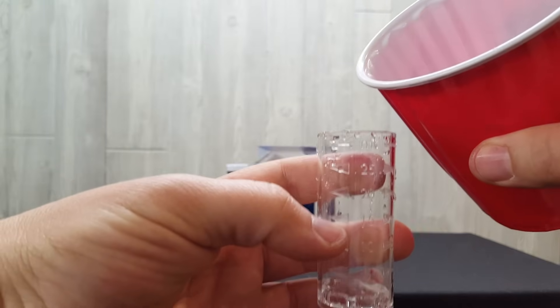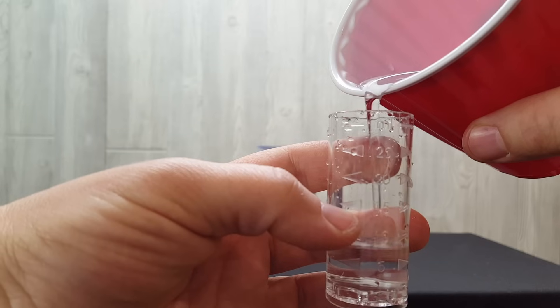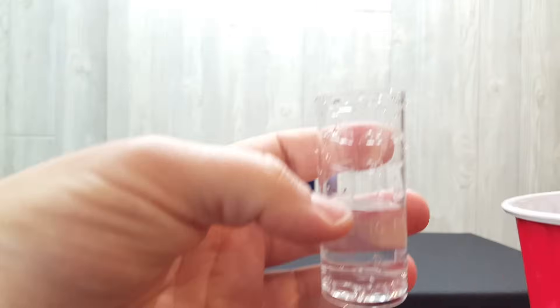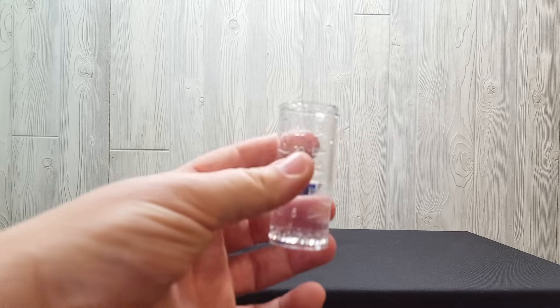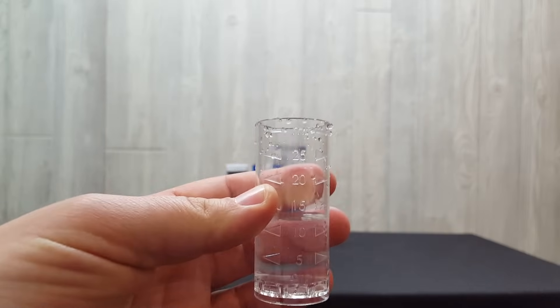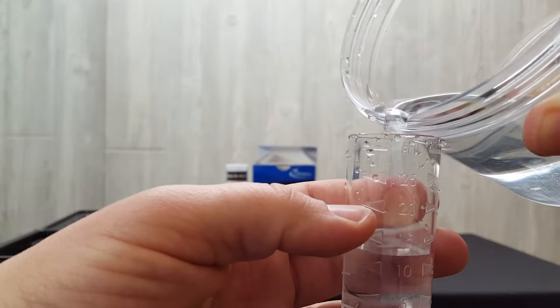Fill your sample to the 12.5 milliliter mark with distilled water. What you're doing is diluting your dissolved ozone sample by half. You always want to put your distilled water sample in first before adding the dissolved ozone sample. Now add the dissolved ozone up to the 25 milliliter mark.